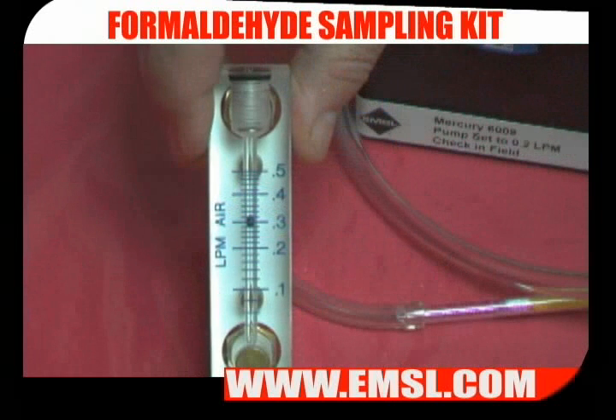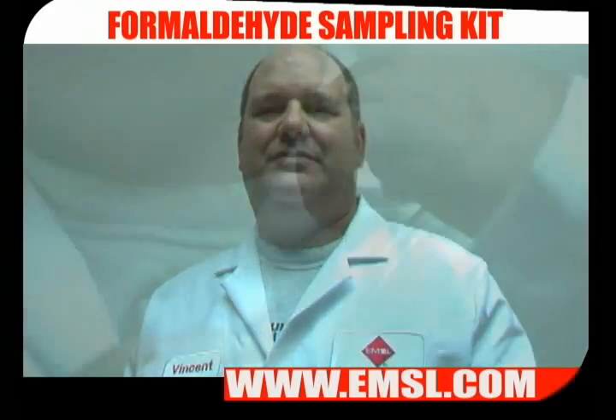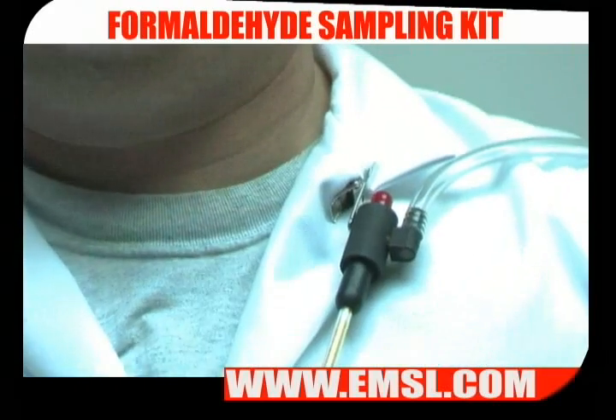The pump should be flowing at about 0.3 liters per minute. Next, place the pump in the area to be sampled — for example, a worker's lapel for exposure sampling.